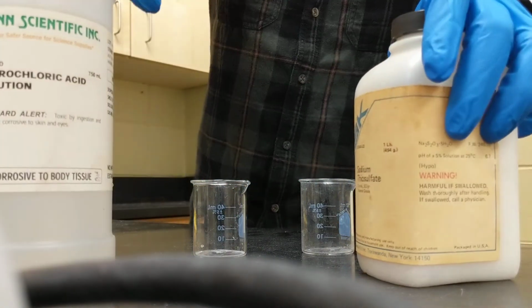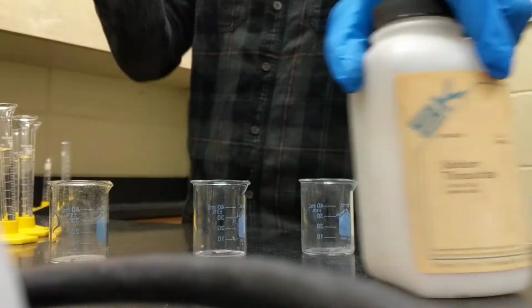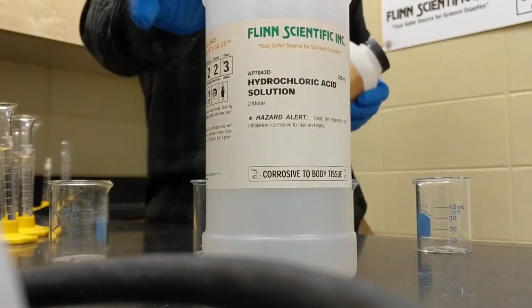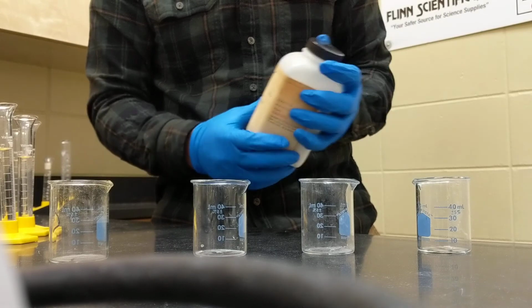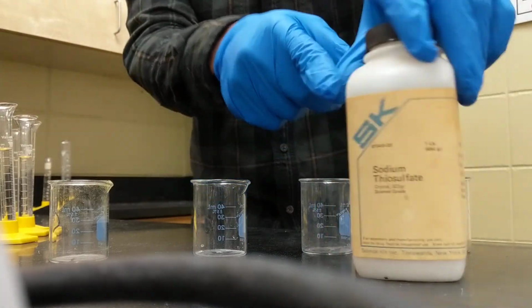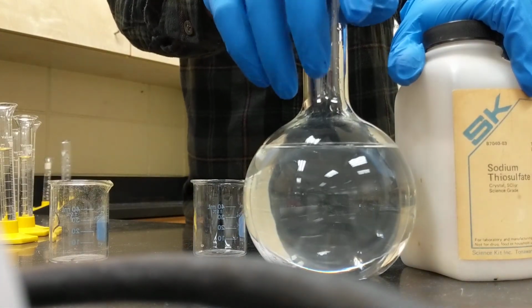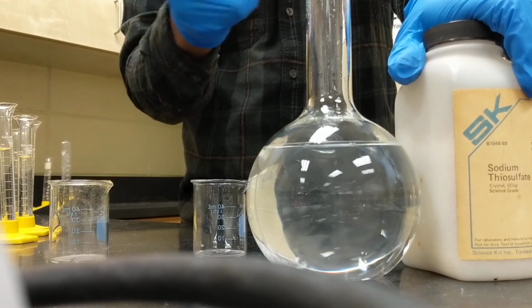Now the two things that are going to be reacted today are sodium thiosulfate and hydrochloric acid. Sodium thiosulfate has medicinal uses. It can be used to treat cyanide poisoning and has some other interesting things that it can be used for. We have diluted it to a molar concentration of 0.15 using this round bottom flask, if you will.